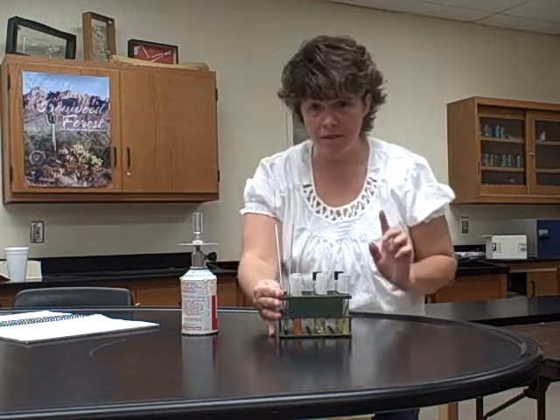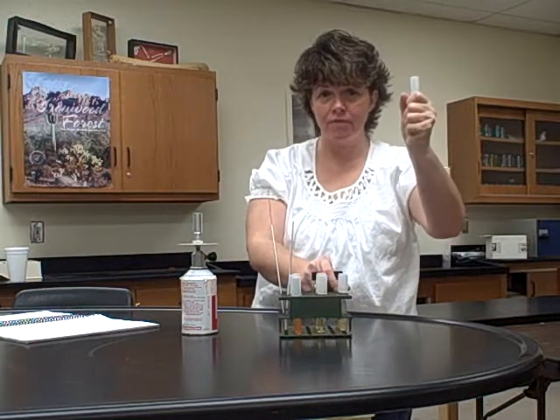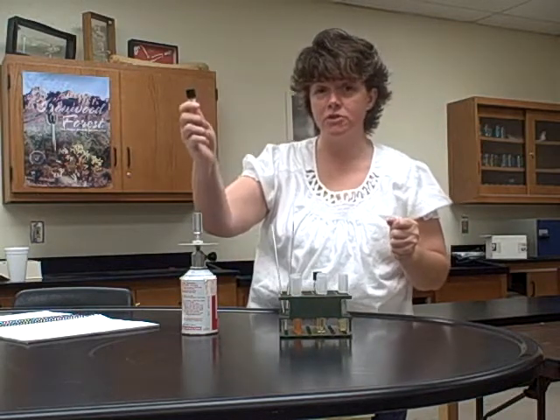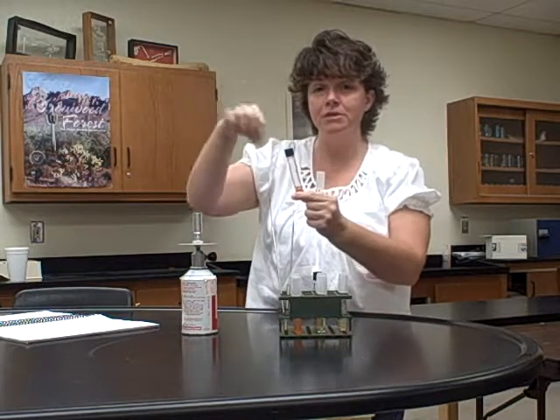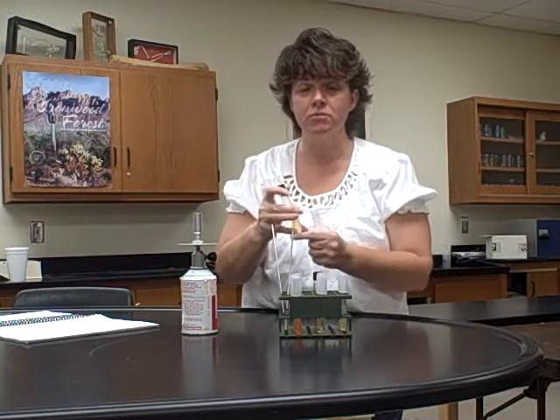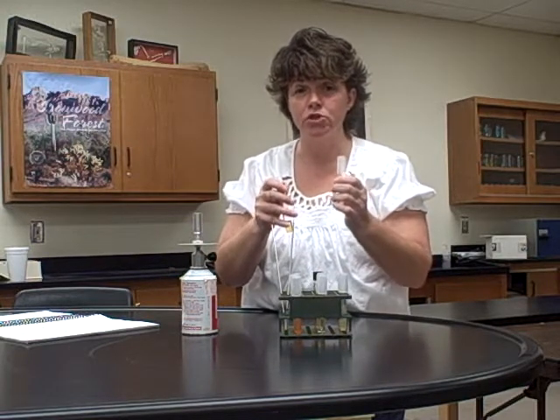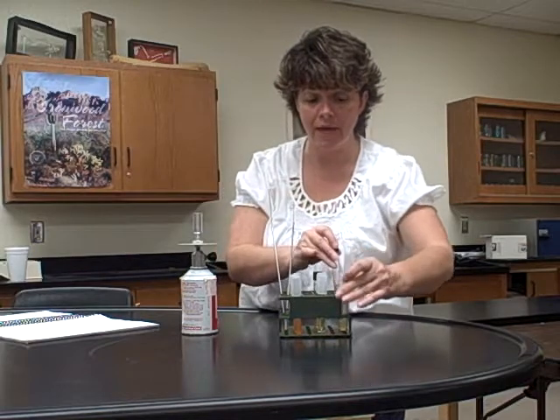I do not want to see one student holding the tube of broth and another person holding the culture, one person dipping from the culture and the others working as a team that way. I want you guys to work as a team to help each other understand, but I want every single person doing their own inoculations, okay?